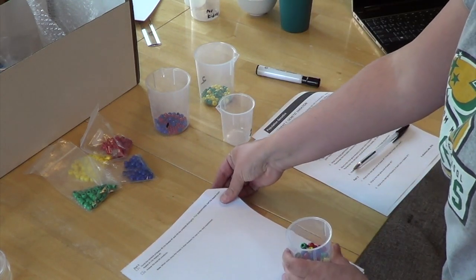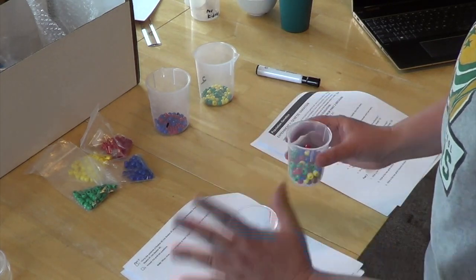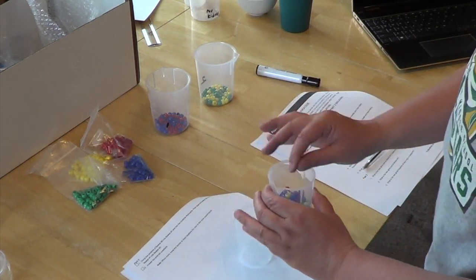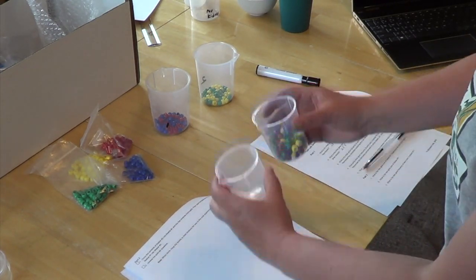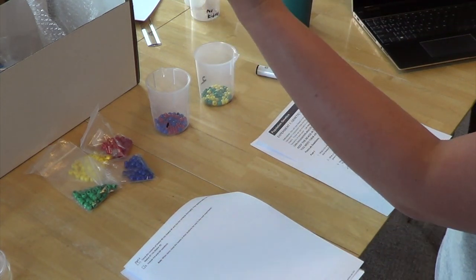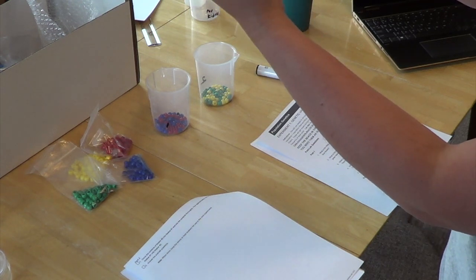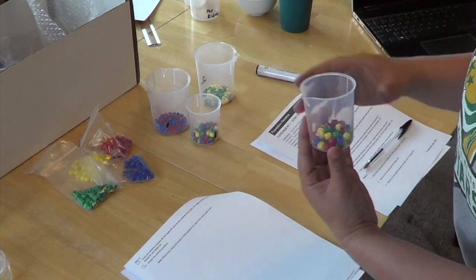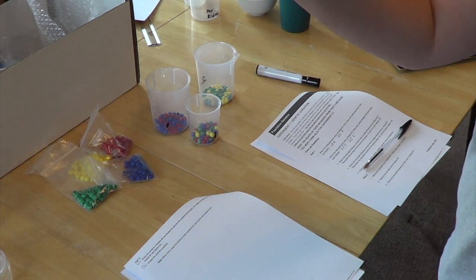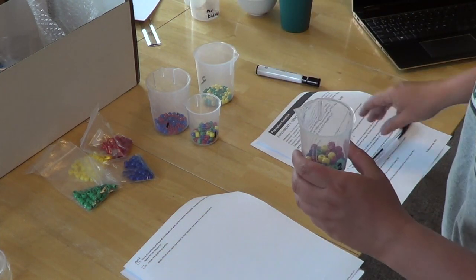And then it says pour approximately half the beads from beaker 1 into beaker 2. So this does not have to be exact. You're not having to count out little beads, just pour. And then look, that's not half. Okay, that's about half.